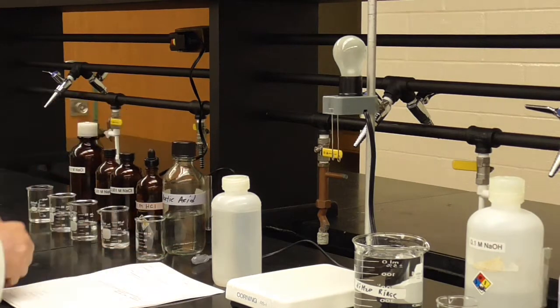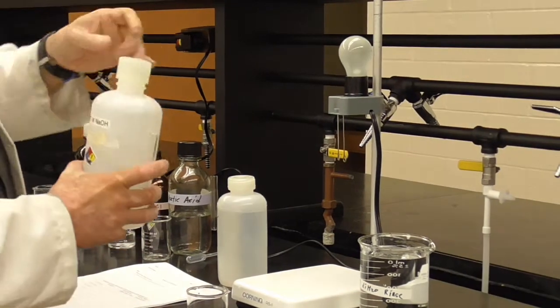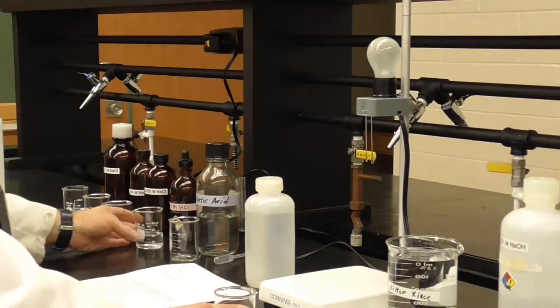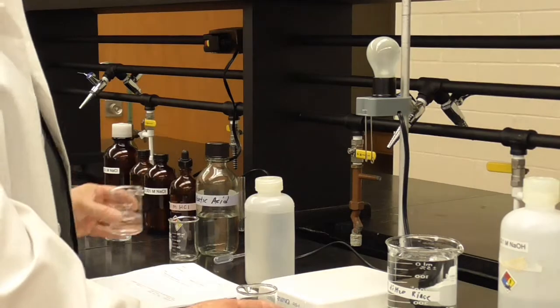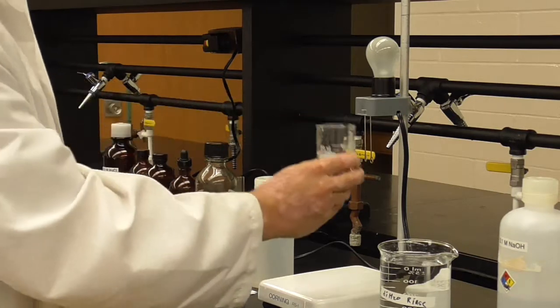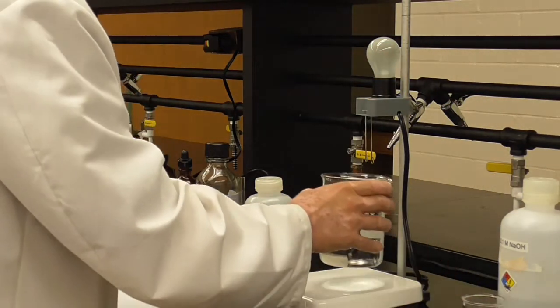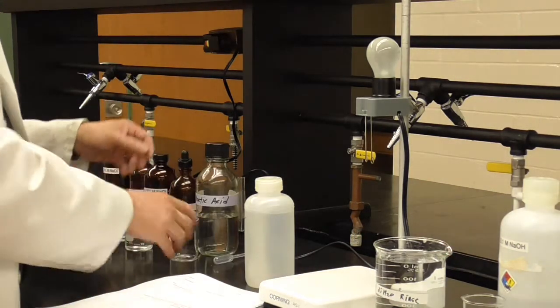Next, I'm going to go in order of the sheet. Next is 0.1 molar sodium hydroxide, so that's this one. Hydrochloric acid, that was an acid, this is a base, sodium hydroxide. The same concentration, 0.1 molar. Okay, so again, in comparison, here's the acid, 0.1 molar HCl. Okay, and rinse it off. 0.1 molar sodium hydroxide, NaOH. Just about the same, I'd say. Very bright. So they're both conducting electricity fairly well. Both are strong electrolytes.